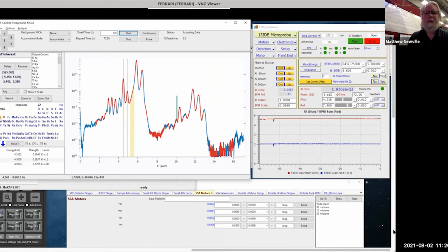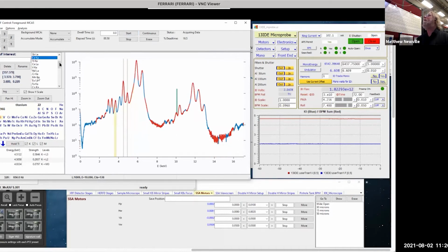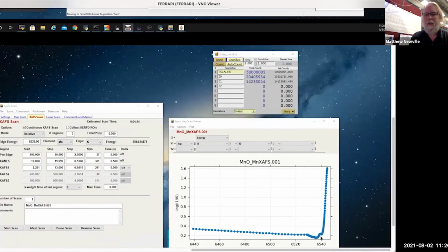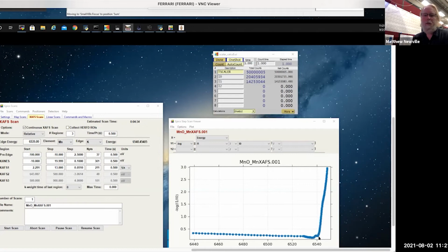Okay, but we're going to see the pre-edge peaks. Now we're just starting to go up the edge. If I show what the manganese counts are in the fluorescence, manganese counts are now going up to a million counts per second or so, and at the edge we now have a little bit of a pre-edge peak. Actually, it's probably about the same energy, but in a different spot relative to the main edge. And we see the edge. So this is transmission XAFS, and I might say that that's enough transmission XAFS.